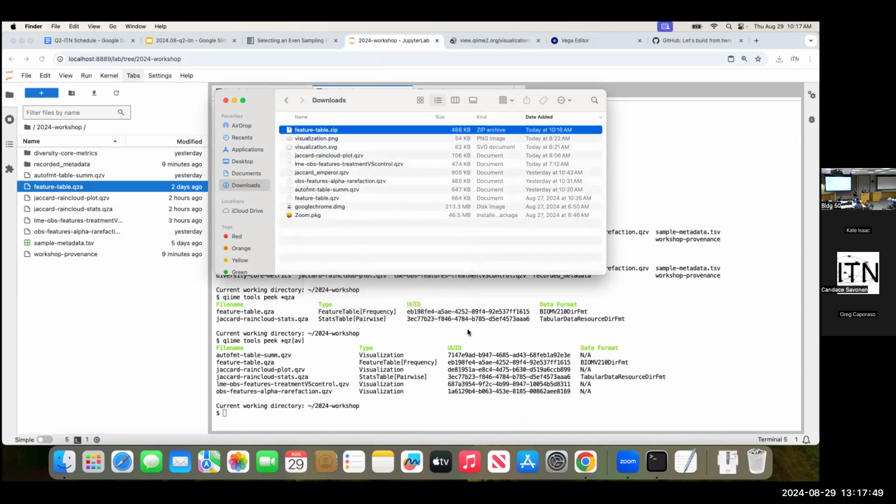And what these actually are, just in case you're wondering, is gigantic numbers. You see some letters in there, but it's because it's using base 16 numbers. So rather than 10 digits, 0 through 9, there's 16 digits, 0 through 15, and the letters A through F are used to represent digits in this case. So this is a huge number.